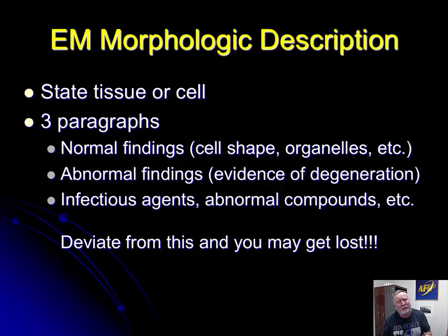You can't describe something that's supposed to be there and that is not. And there's something, because we're so up close, we're going to talk about later on in this lecture about when do we say something's missing and when do we say it's not.